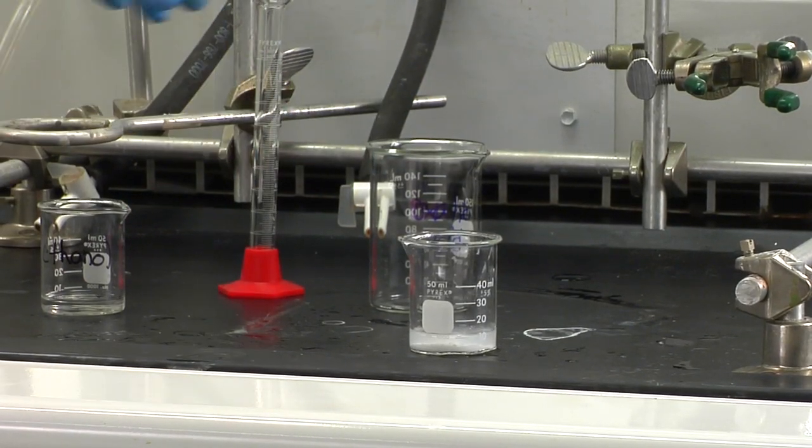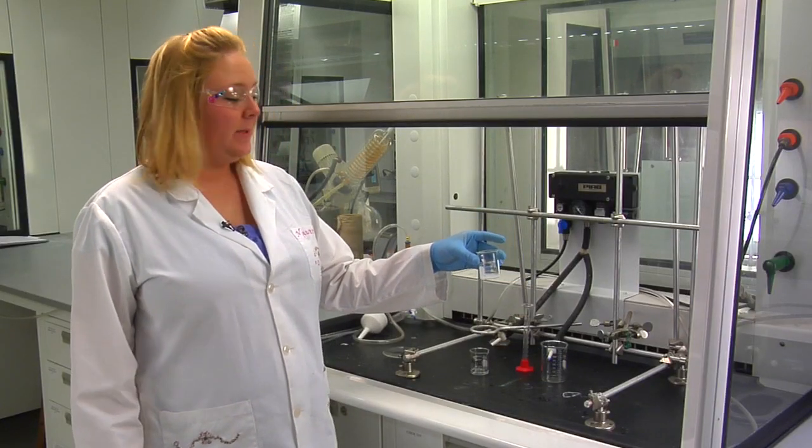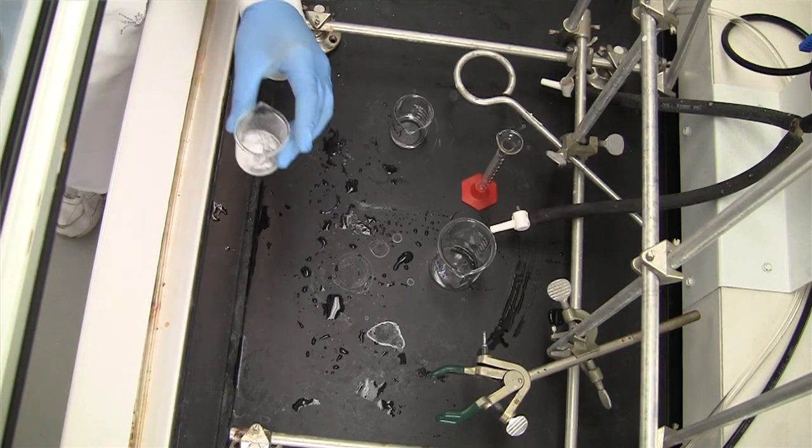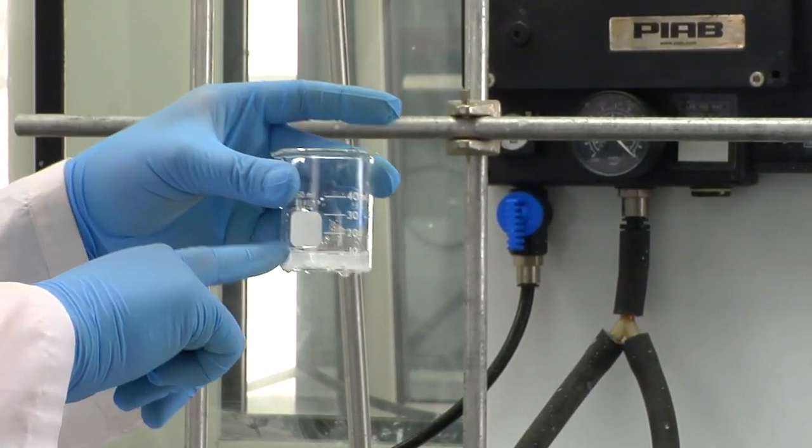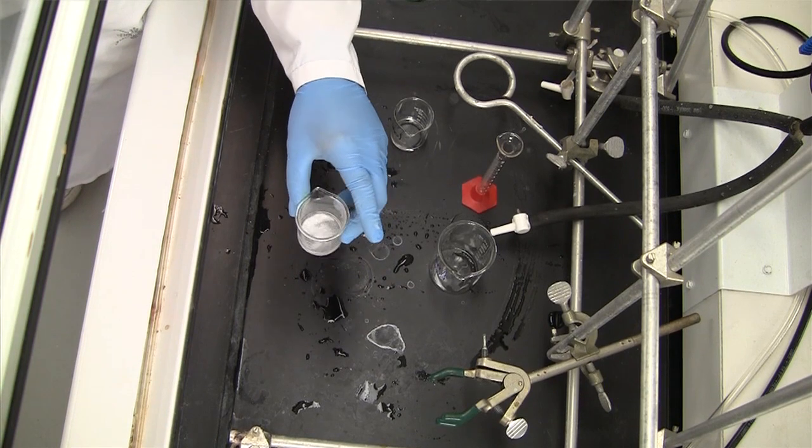We're going to mix that together. We're then going to dissolve this on the steam bath set up in a separate hood. You want to make sure that the level of ethanol stays the same. You can do this by adding a watch glass to the top or just adding ethanol as needed.